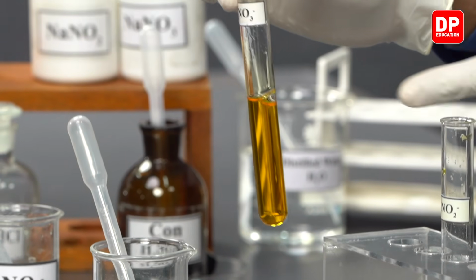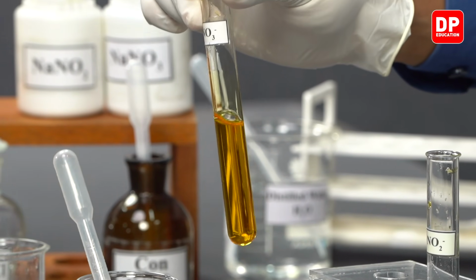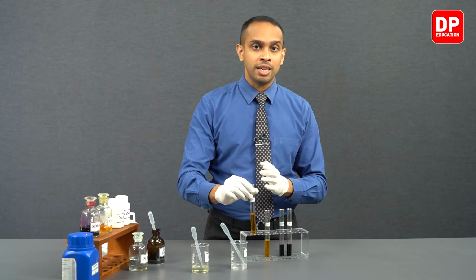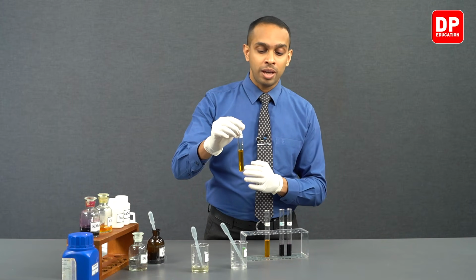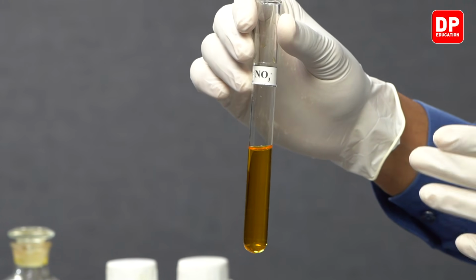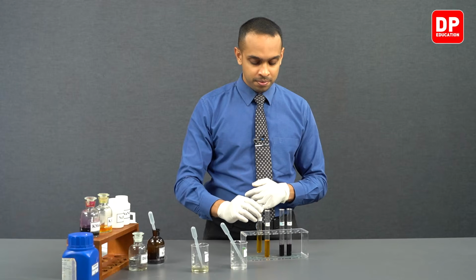Do you observe any change here? The answer would be no. Acidified potassium dichromate is an oxidizing agent. And can you further oxidize nitrate ions? The answer to that would be no. So therefore, in the presence of acidified potassium dichromate, you can't further oxidize nitrate ions. So therefore, there will be no reaction here and you will not observe a color change.